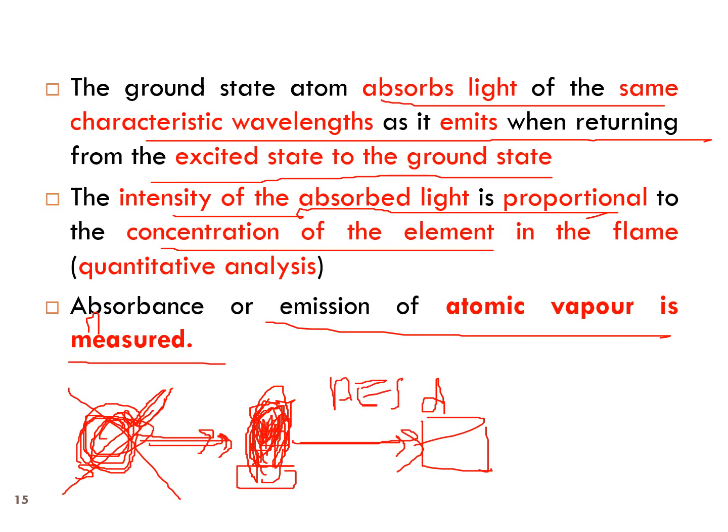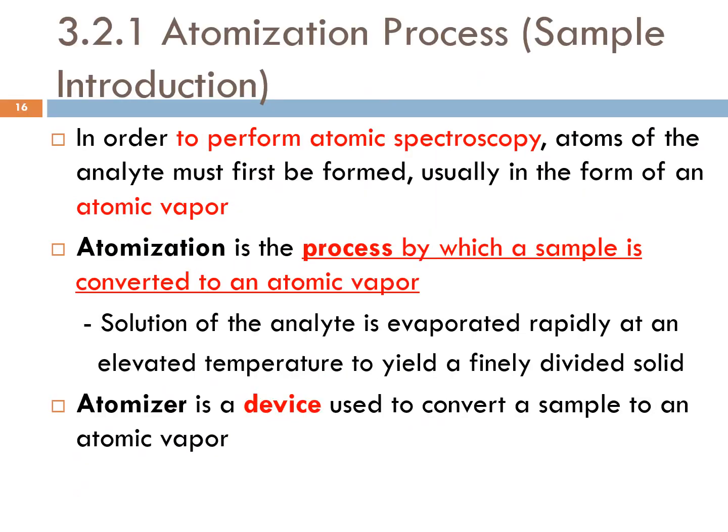AES. Kalau untuk AAS, dia kena ada source of light. Okay, yang ni kita akan pergi detail. So, ni just brief lah. Okay. Untuk atomization process or sample introduction.